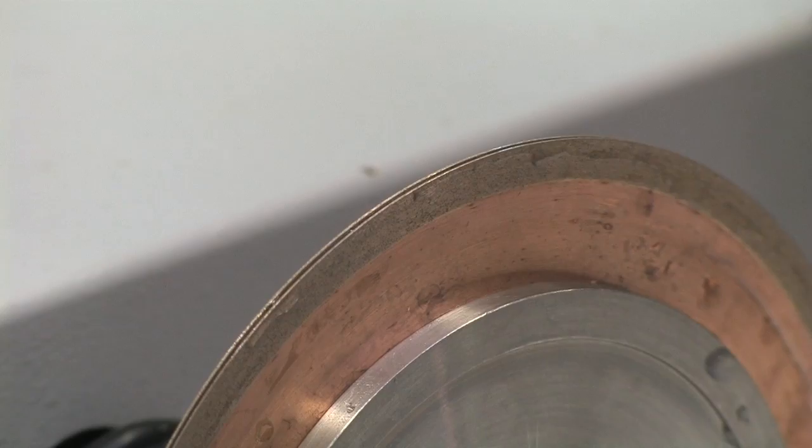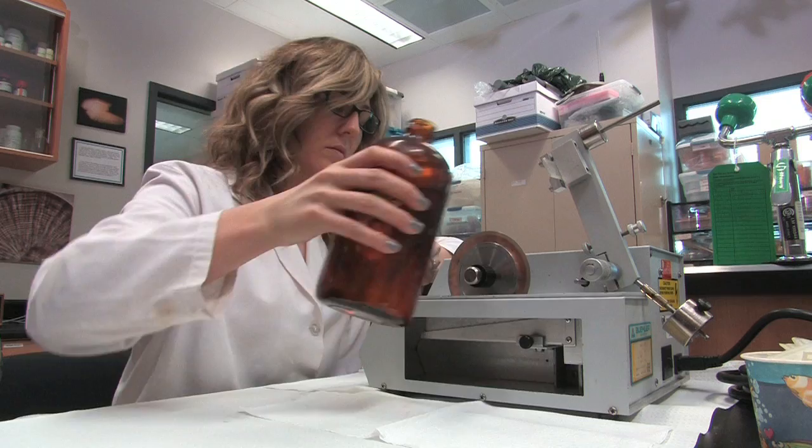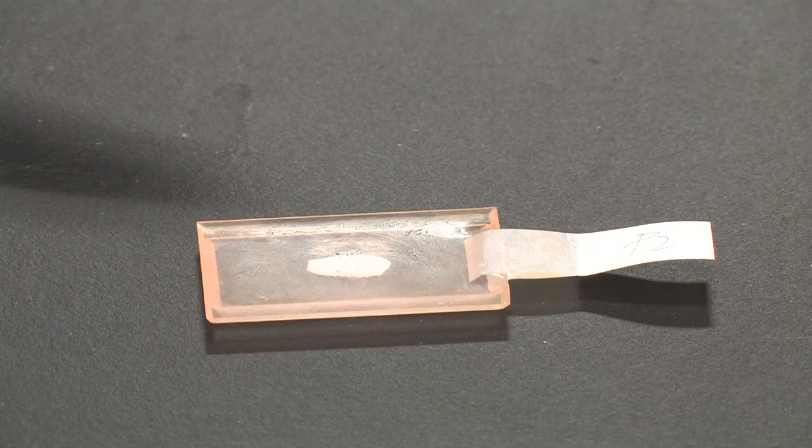Fill the reservoir with a 60-40% glycerin to water mixture until it covers the lowermost centimeter of the blade once the well is in position. A solution of a small amount of dish detergent and water can be used in place of the glycerol. Glycerin acts as a lubricant to help the blade cut through the sample.